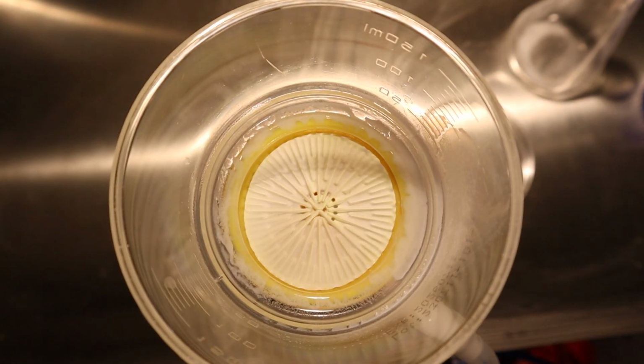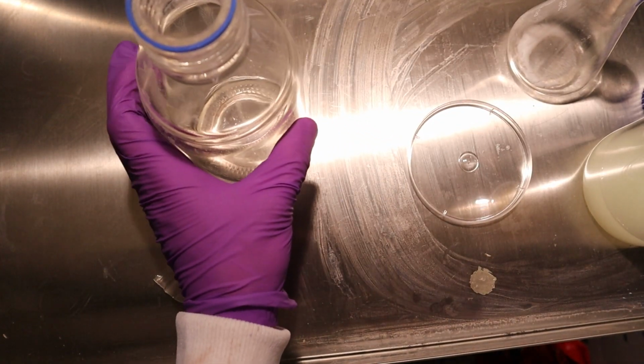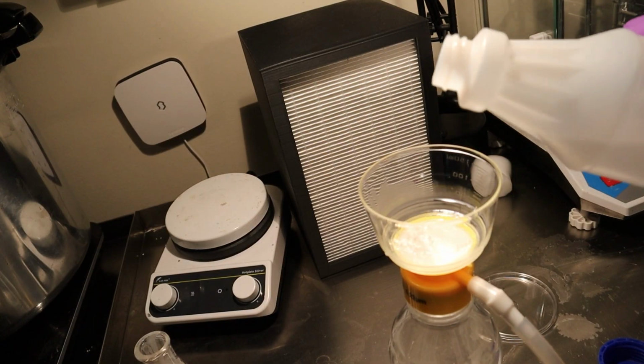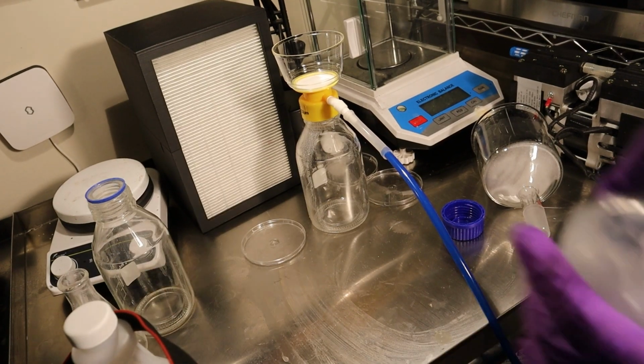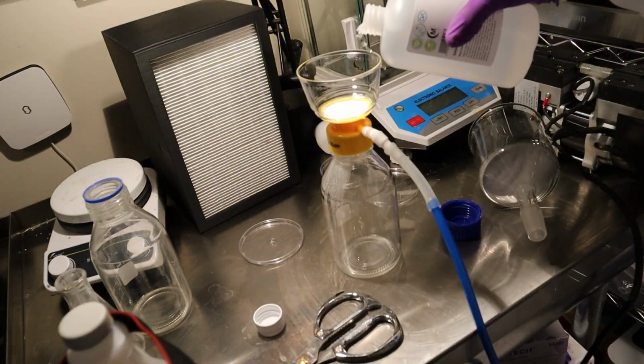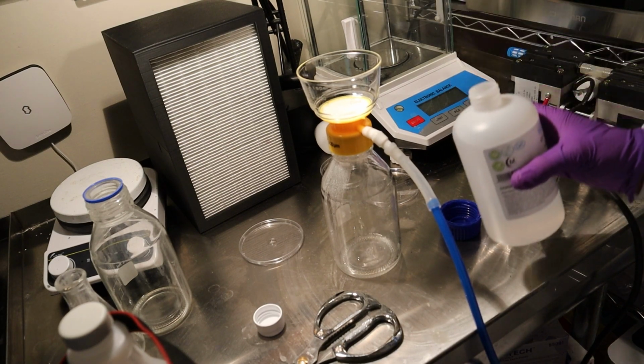That went terrible. Oh yeah, it turns out acetone dissolves the PES membrane used for these filters. I tested some ethanol after the failure to see if that would have worked, and it did. I had to start over.